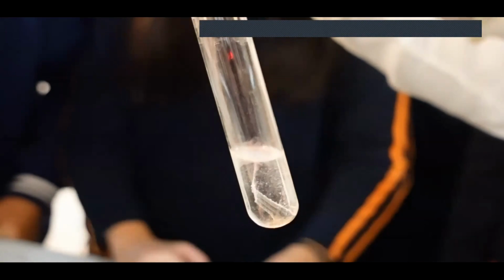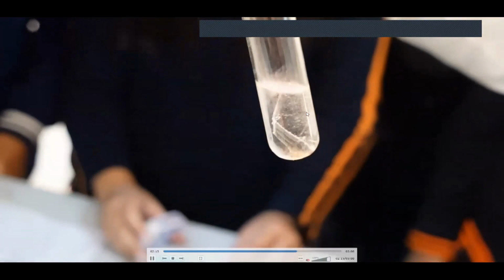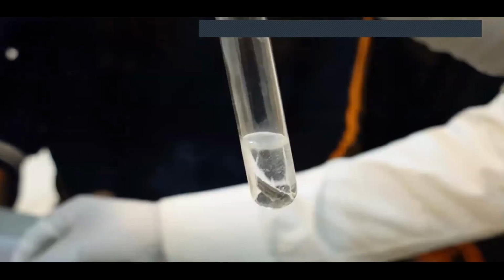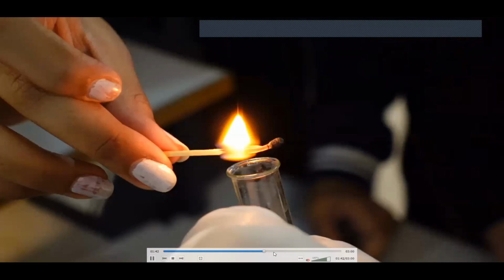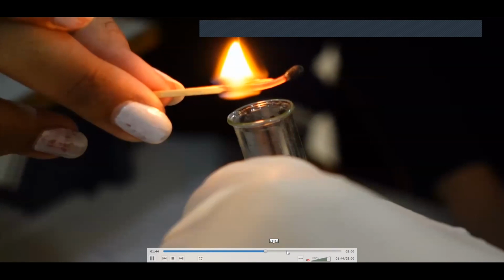And do you notice that there's a lot of fizzing there? There's a lot of bubbles there, as you can see over here. This is magnesium reacting. Copper के साथ कोई bubbles नहीं थे. यहाँ पर there's a lot of bubbles coming out. Okay, do you see them? But they are not as fast or as frequent as it was with what you call sodium.